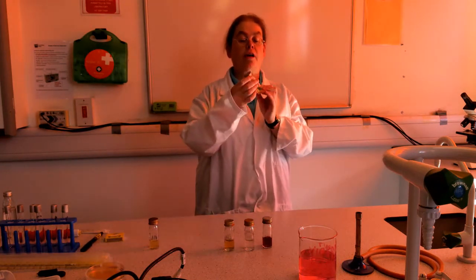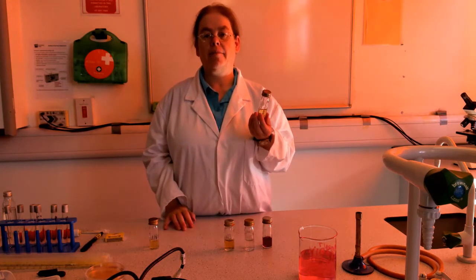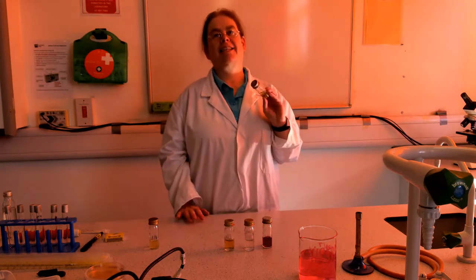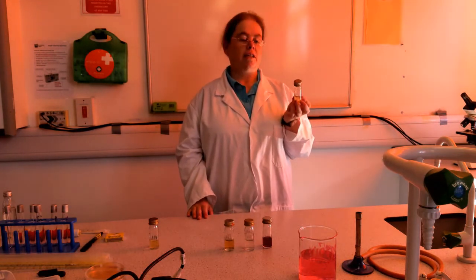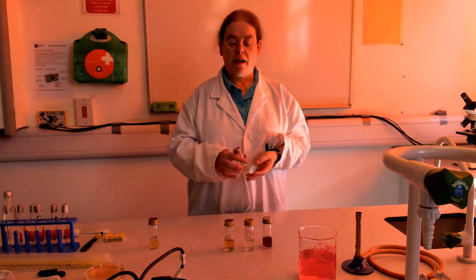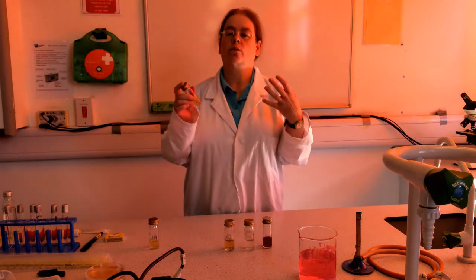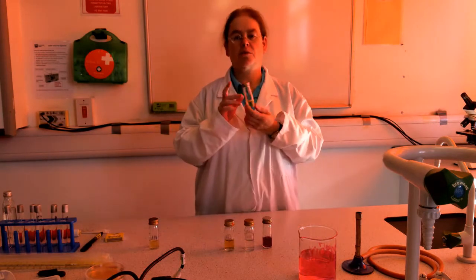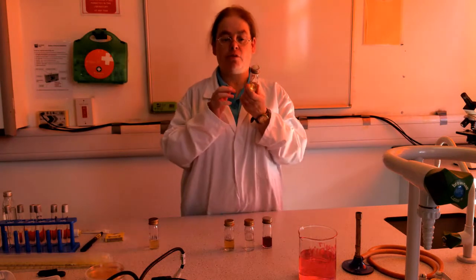So we have nutrient broth, which is the standard food for bacteria. It's basically beef extract, yeast extract, some sugar, so soup. The point is it's got vitamins, there's also minerals added, salts and stuff, calcium salts, all sorts of stuff they need. Anyway, it's supposed to be super duper food for bacteria.